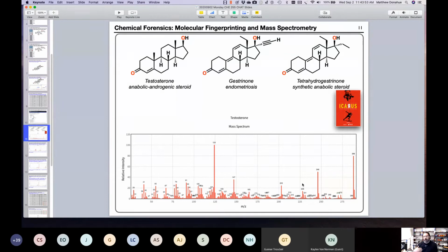The reason athletes have to give urine samples is that the urine is injected onto a mass spectrometer, and they can see if there are above-normal levels of testosterone. Synthetic testosterone will look different from testosterone that your body produces. That's how people get caught doping.